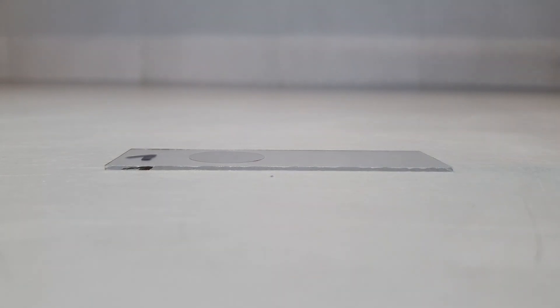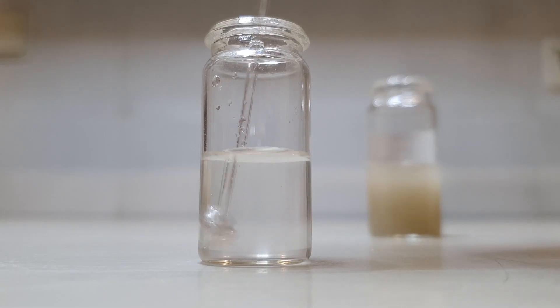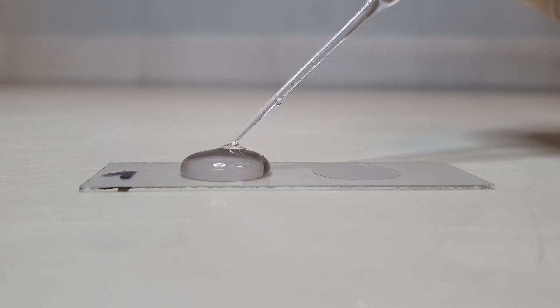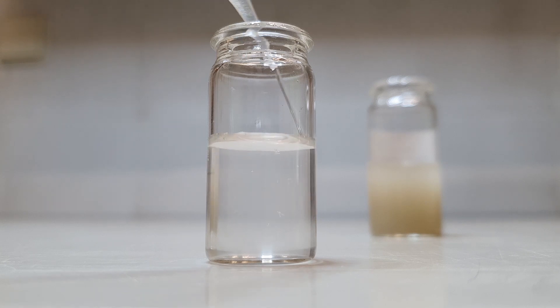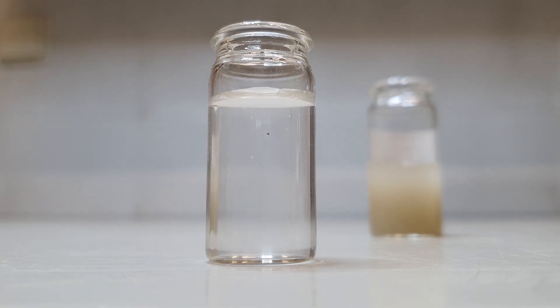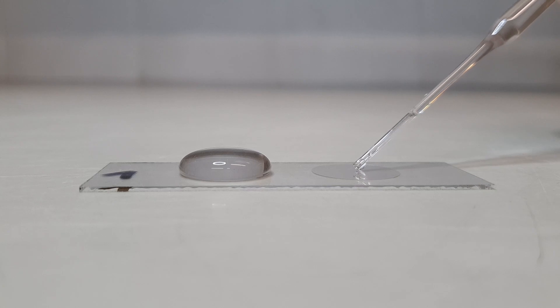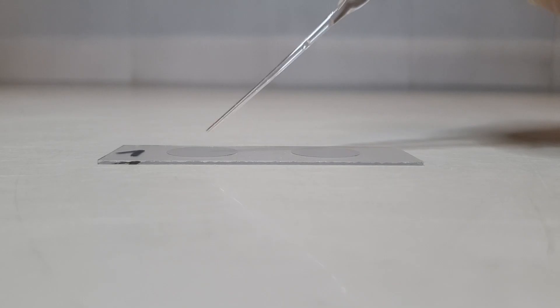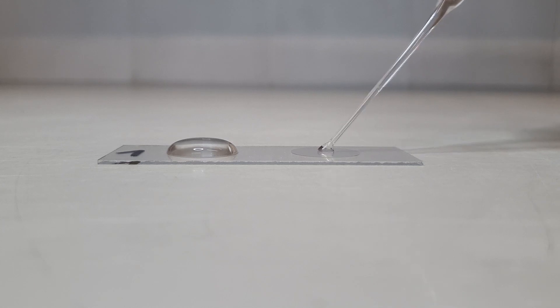Place two cover slips onto a microscopic slide. Homogenize the diluted suspension and carefully fill up the first cover slip with the diluted sample. To obtain a second subsample with a different concentration, fill the glass vial all the way up with distilled water and repeat the procedure with the second cover slip. Alternatively, you can also transfer different volumes of the diatom suspension onto the cover slips.